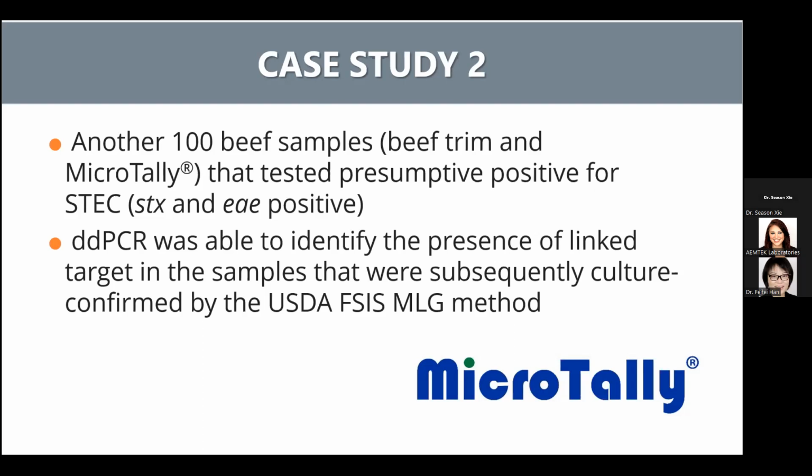This case study highlights the power and efficiency of ddPCR in confirming the presence of specific linked target genes in STEC strains. The ability of ddPCR to accurately identify the co-localization of STX and EAE genes provides valuable insight into the pathogenicity and virulence potential of these strains.